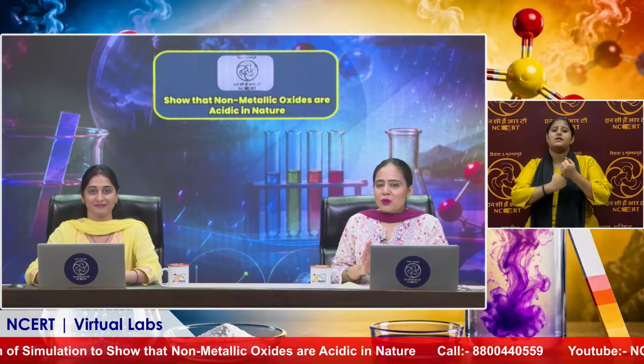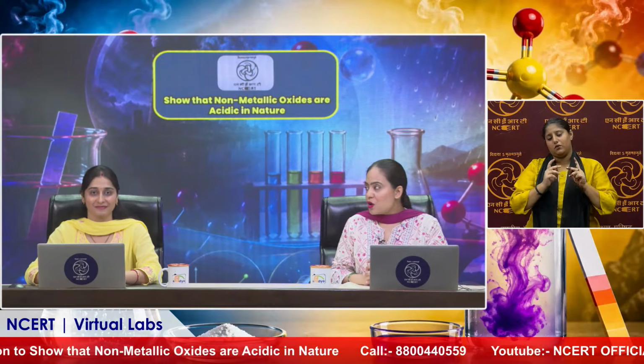Great. Now we're talking about simulation of chemistry, right? And when I think of chemistry, I really want to go to the physical laboratory. I want to hold the test tube and the beaker. I want to perform the experiment myself. But am I going to get the same kind of learning through virtual lab when it comes to performing the experiments of chemistry?